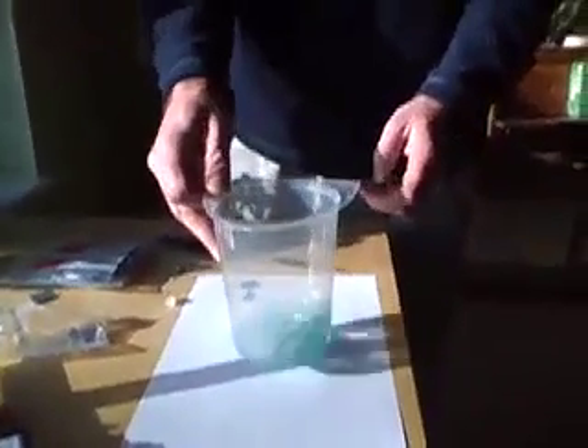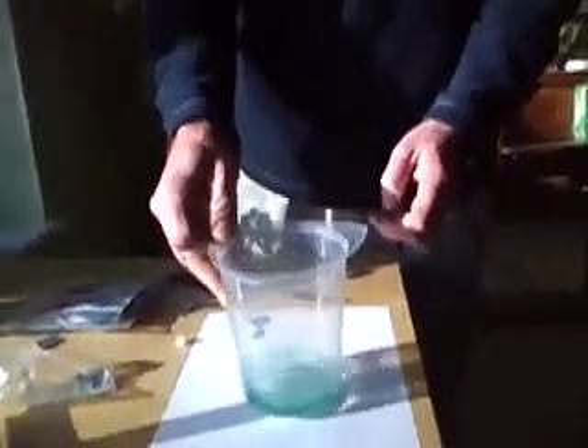This is bromocresol green, so now I've opened up a sachet, I'm going to add it to the water, and my able assistant here is going to zoom in and show you the colour, and we add it to the water. You can see it goes a nice green colour. Just mix it up, and that's the starting colour, and it's this nice tree leaf green.